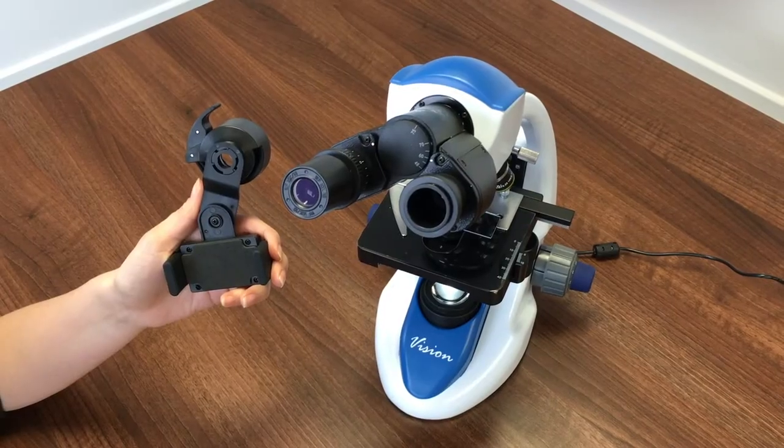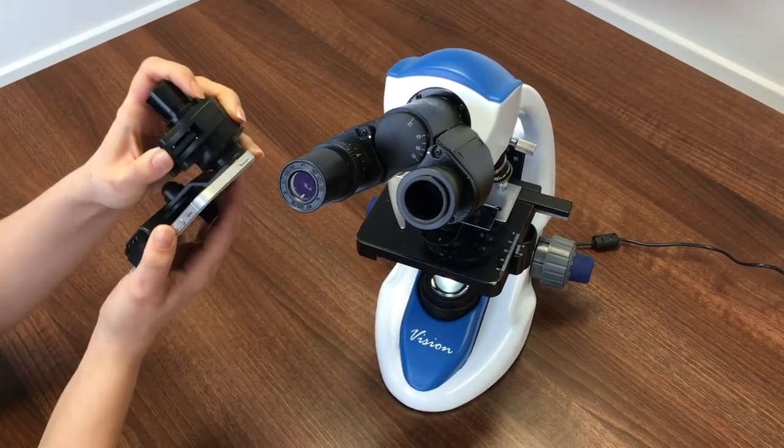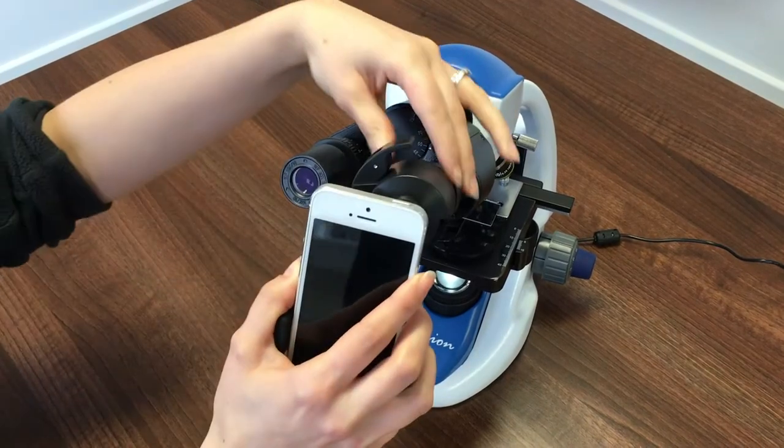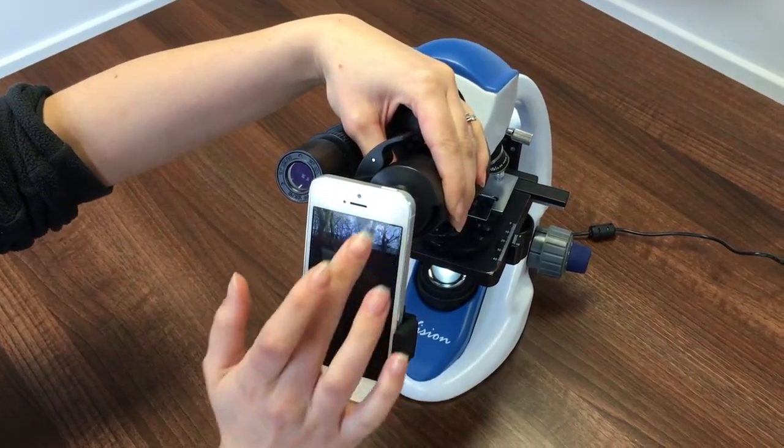Remove your phone cover if present and secure the phone into the grip so that it is flat against the phone pad. The internal spring should allow the phone to be secured into place. Place the eyepiece back on the microscope and switch on your phone camera.